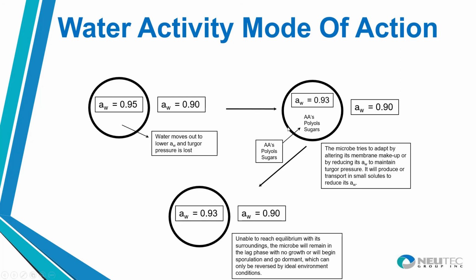So what was the cause? Why did the moisture content specification fail them? The basic answer is that it wouldn't have, if they had been measuring water activity. But what happened was they had switched their moisture content measurement method. In the process of doing that switchover, they had followed the recommendations of the manufacturer, but were getting the incorrect answer.